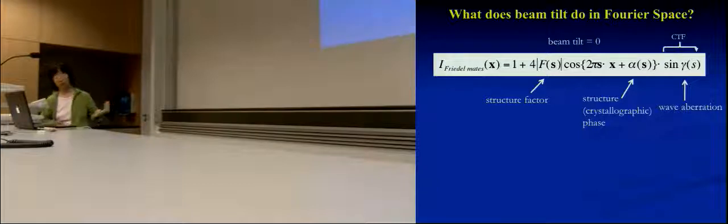So this is actually looking at, I think, the wave functions of a pair of diffraction spots. Let's say you have a diffraction spot at 1, 0 and minus 1, 0. Then to combine the contribution from those two, you get something like this. We want to write it in this form for convenience later. So it has a structure part, which is this whole thing, and in that there is an amplitude, and there is a phase value that depends on this. This is coming from the Fourier transform, so it's the dependence of two things together, like what Henning was talking about. If you look at it exponentially, it's what he has. I'm only looking at it a little differently. So here, the second part is the phase of that structure.